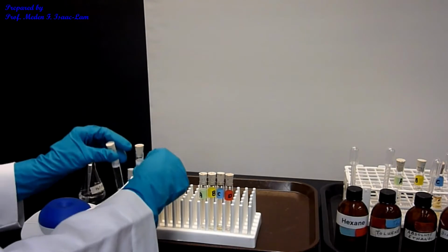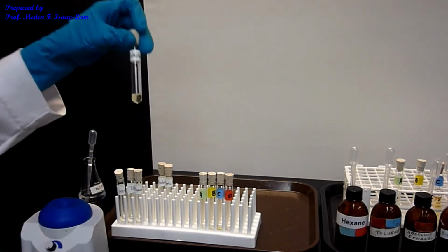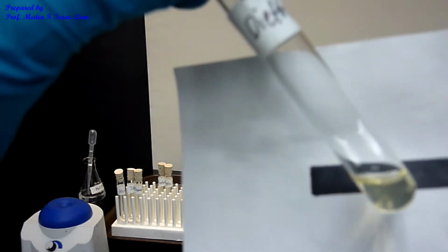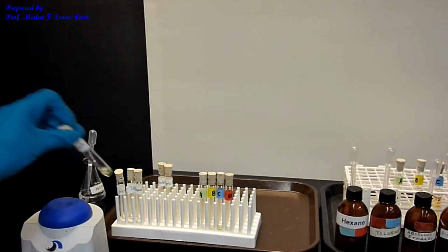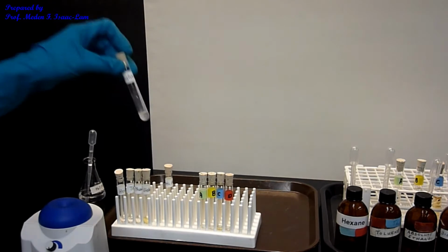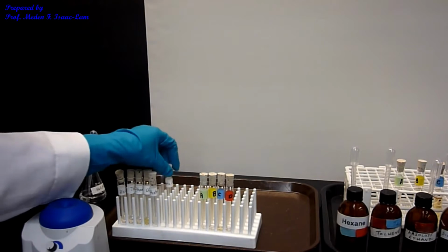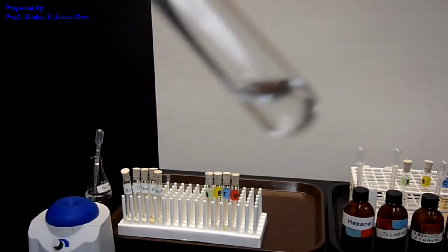Now this is diethylamine, right? And then acetone. I see a little bit of turbidity, but is there a layer or no? And then acetic acid.